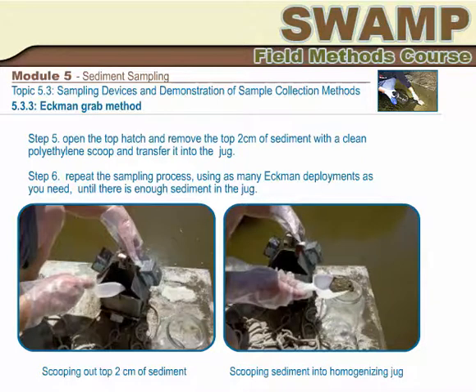If you deploy the grab multiple times, try to move to a fresh spot each time, even if you cannot see the bottom. Please note that compositing multiple grabs will increase the representativeness of your samples, and that is a good thing.